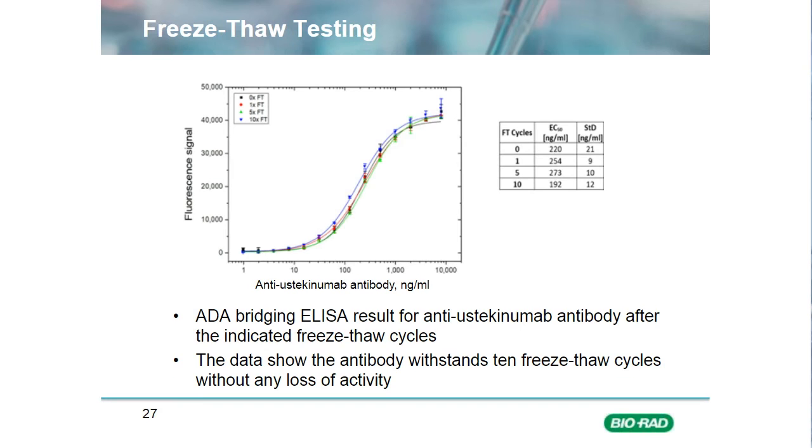Similarly, whilst repeated freeze-thaw cycles should be avoided by basically planning well and aliquoting into appropriate vials and good storage, deliberately subjecting antibodies to multiple freeze-thaw cycles is another indicator of stability and may help identify if any clones have issues with, for example, cryoprecipitation.